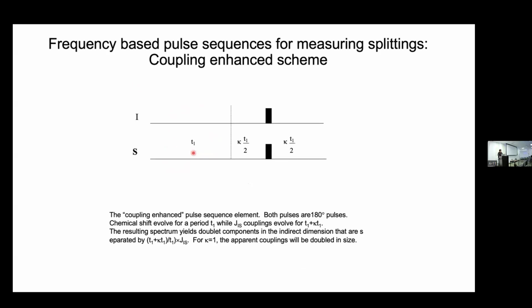Okay, so how do we measure? Now you can put your product operator formalism knowledge into practice. We still want optimal experiments to measure those splittings or J-couplings. And prior to RDCs, there was no real reason to measure one-bond couplings. I mean, nobody really cared. But one-bond scalar couplings have very interesting information. Like in nucleic acids, this J-coupling is strongly correlated to the dynamics, like the order parameters.